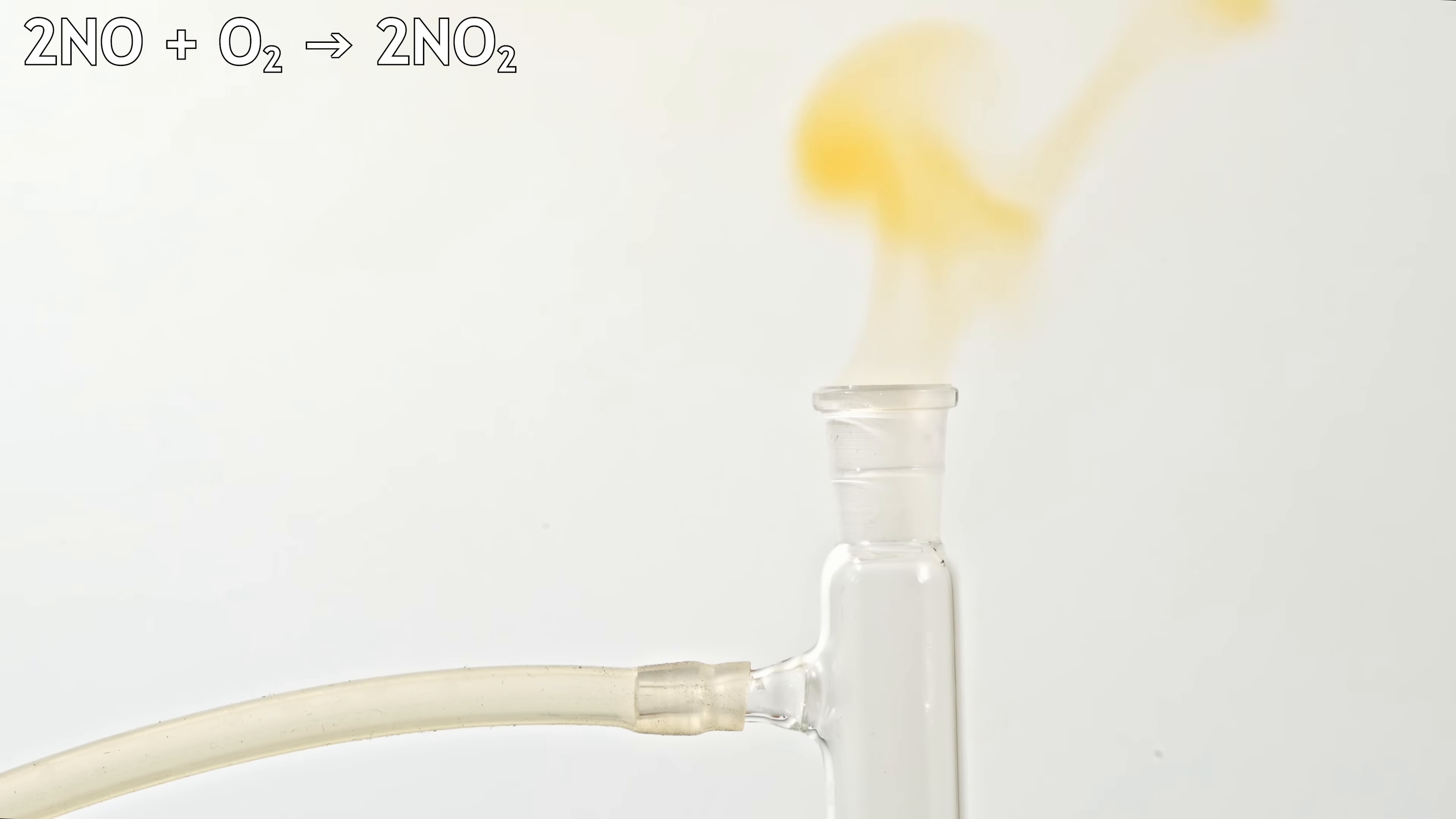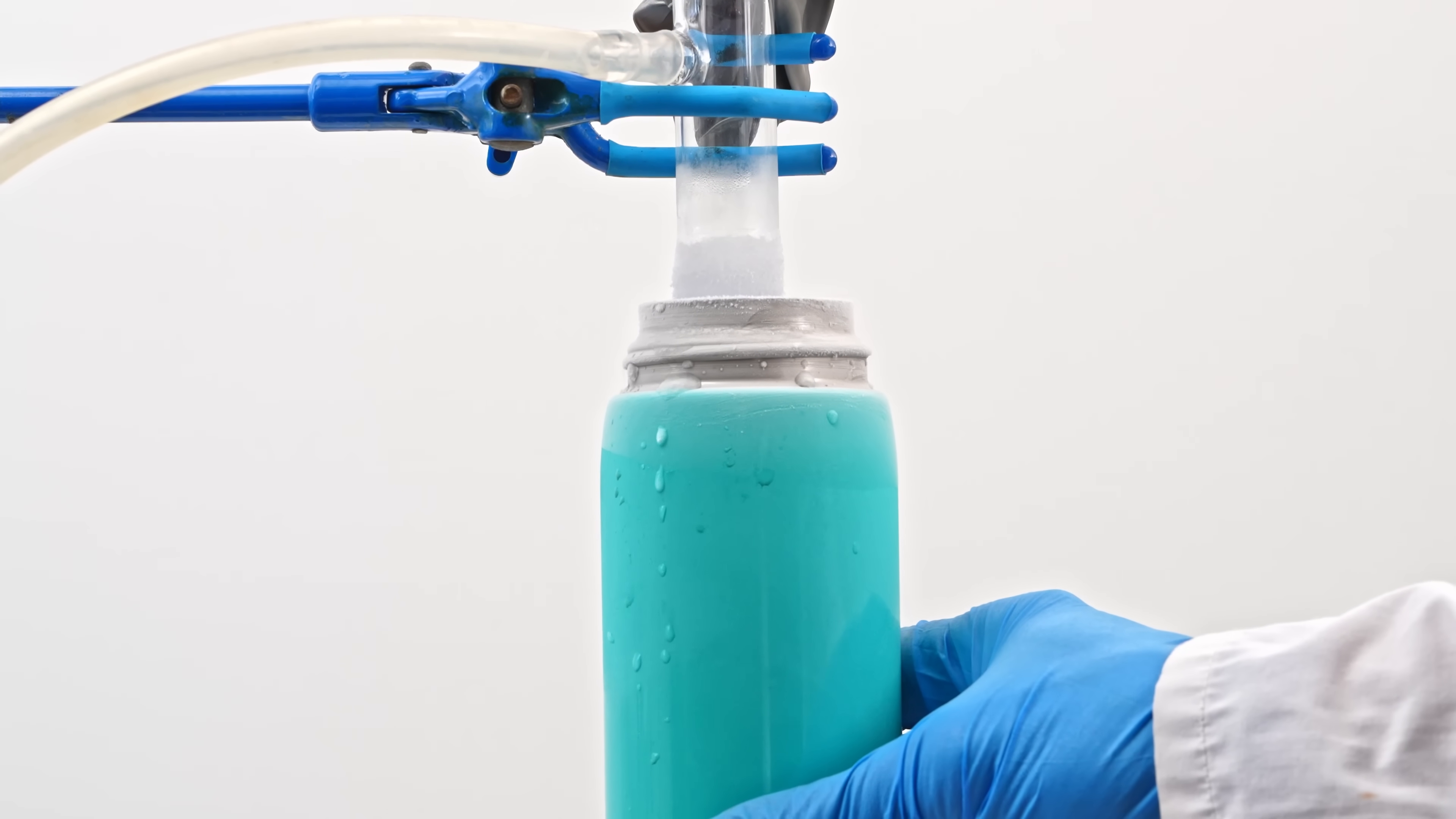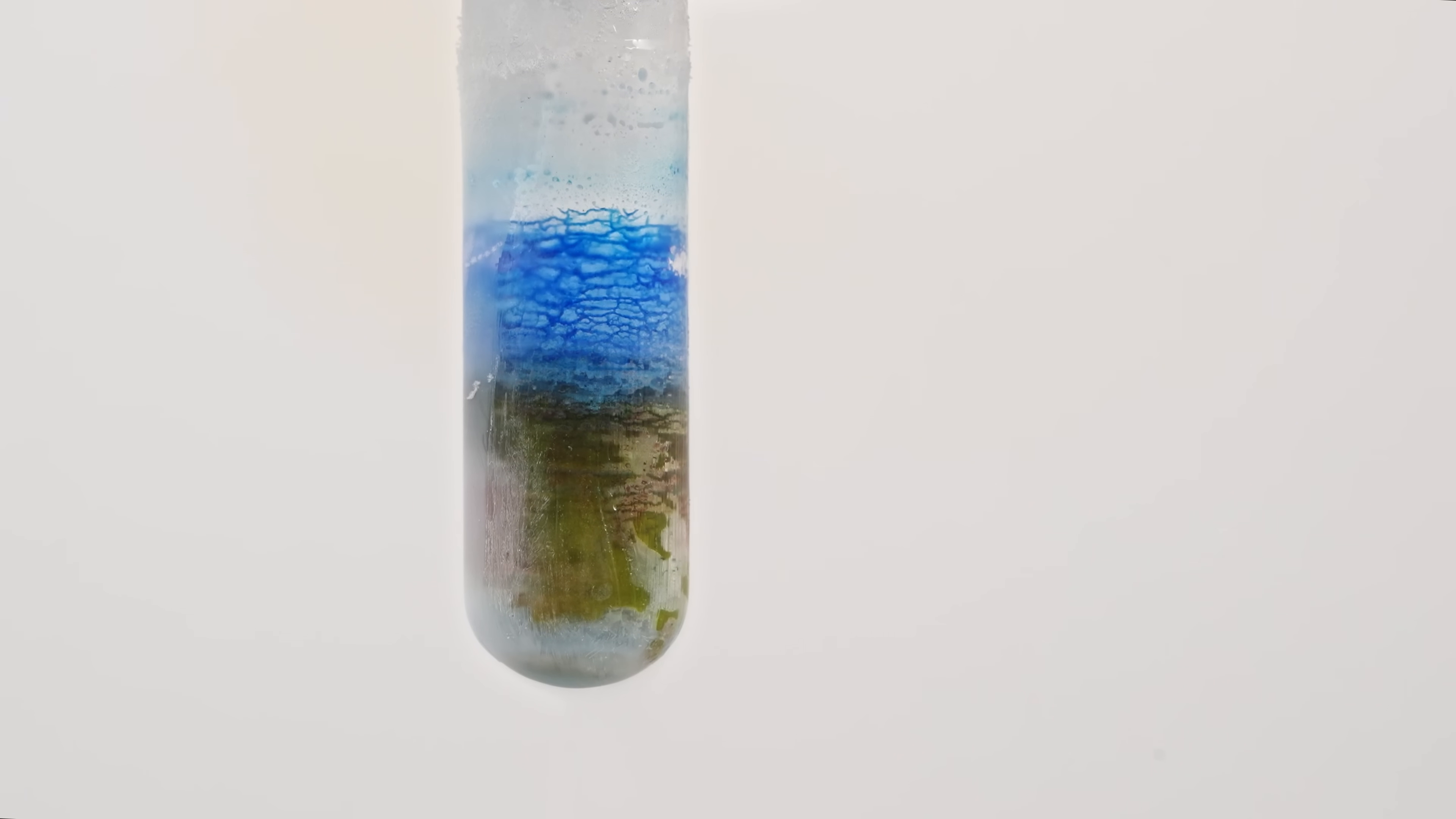Here you can see the colorless gas turning reddish-brown at the point of contact with air. But what happens when we condense this gas using liquid nitrogen? Look at these fascinating colors. You can see blue, green, and even red. It's very different from all other liquefied gases.